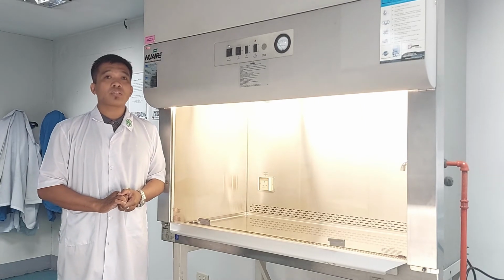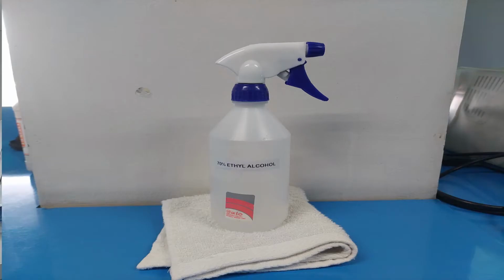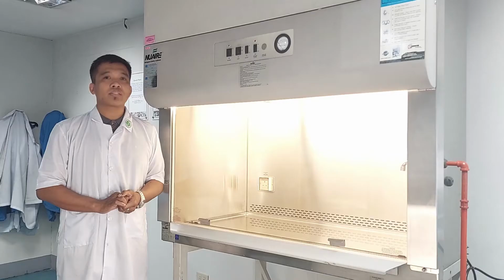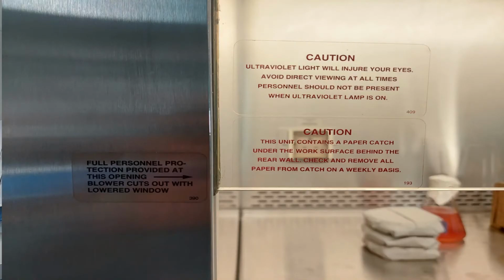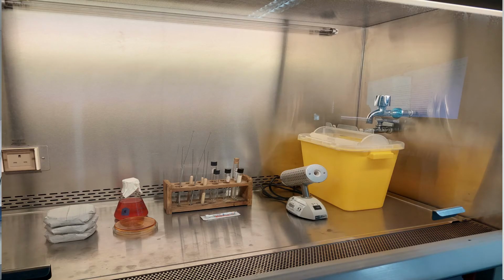Observe surface decontamination. Decontaminate the work zone with cleaning agents before and after use. Observe correct sash opening height. Always set the sash to the work height when working in the cabinet. Observe proper aseptic technique. Work from clean to dirty. Segregate contaminated from sterile materials.